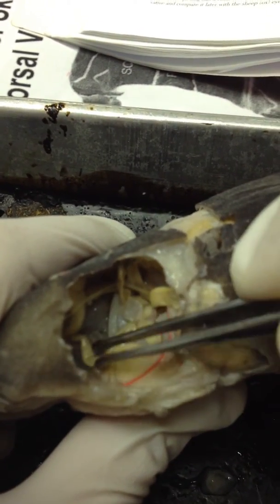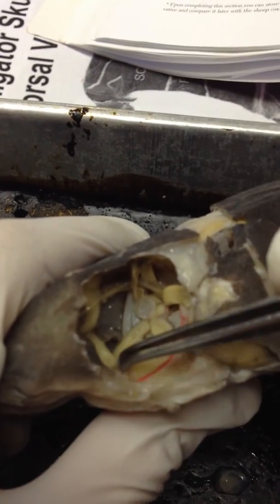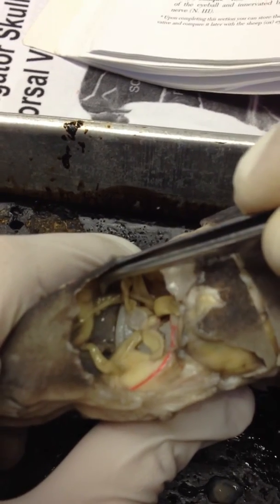On this side of the shark, we have the inferior oblique and the superior oblique.